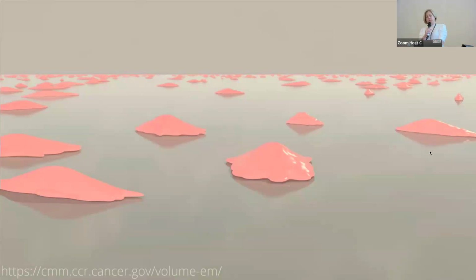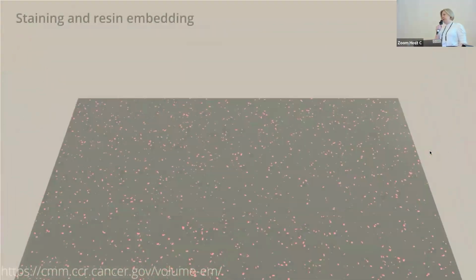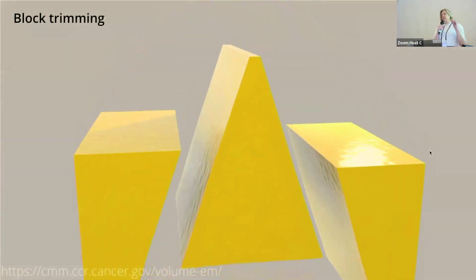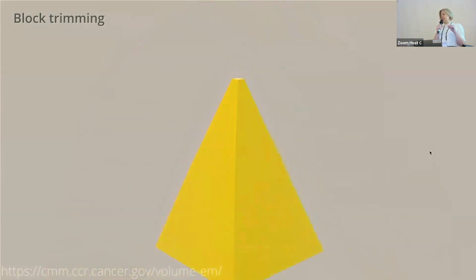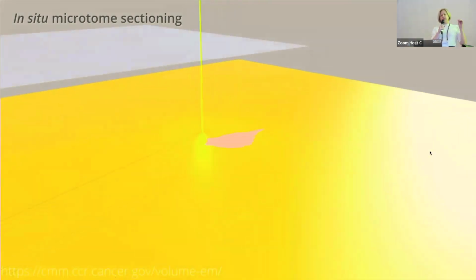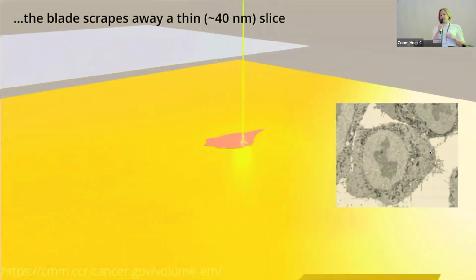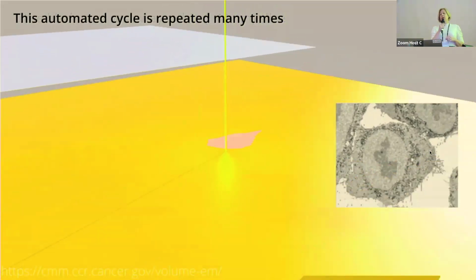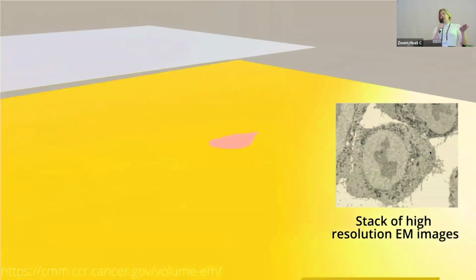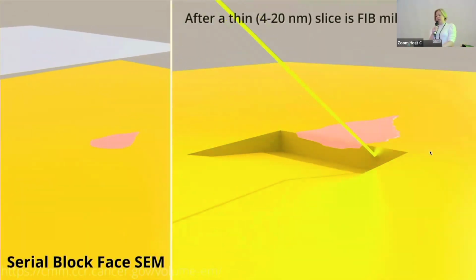There's a second group of techniques, which we call block face techniques. We can start in the same way with cells or tissues, embed them in resin. But this time we take the block and put it inside a scanning electron microscope, which has a very large chamber. And so we can use different methods to start imaging and then cutting inside the chamber. Here with a diamond knife in serial block face scanning electron microscopy, or using a gallium ion beam or a plasma ion beam, which can then cut much thinner sections. But again, we're generating these stacks of images, which we then put together.